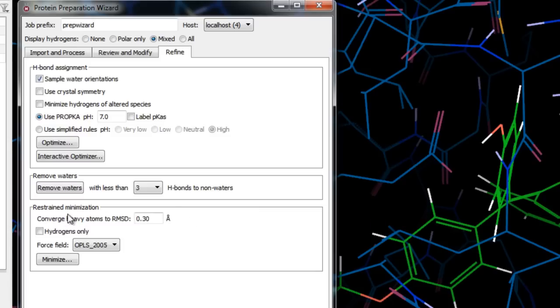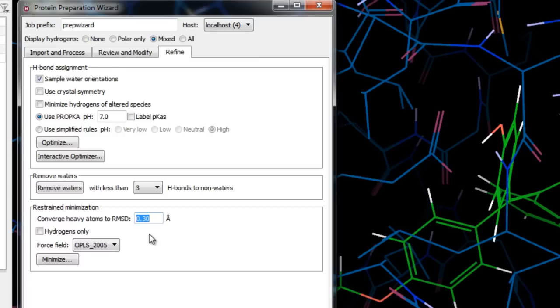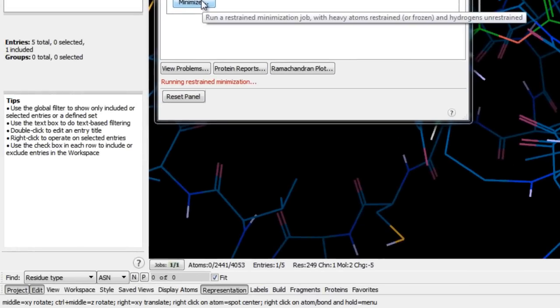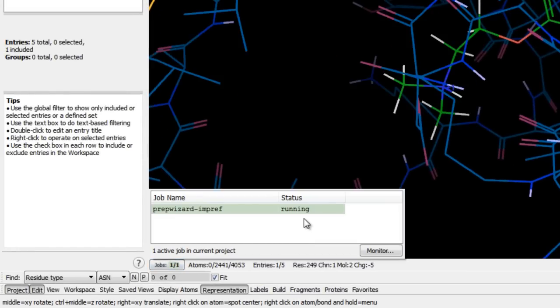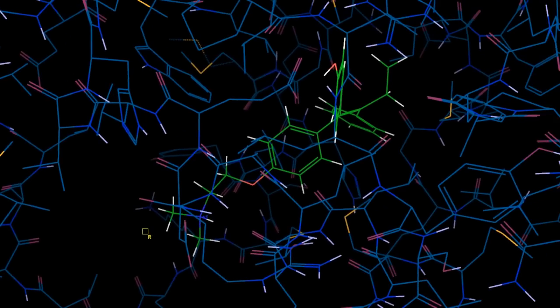The final step is to refine the structure by running a minimization in which heavy atoms can be restrained so that strain is relieved without deviating too much from the input geometry. We also have the option to minimize hydrogens only, though hydrogen atoms are not restrained even if left unchecked, which still allows the optimized hydrogen bonding network to be refined. We specify the RMSD of atom displacement for terminating the minimization — 0.3 angstroms is a good default for alleviating steric clashes and relaxing sidechains. We'll click Minimize, monitor the job in the Job Monitor panel, and once complete we have a fully prepared protein ready for modeling.